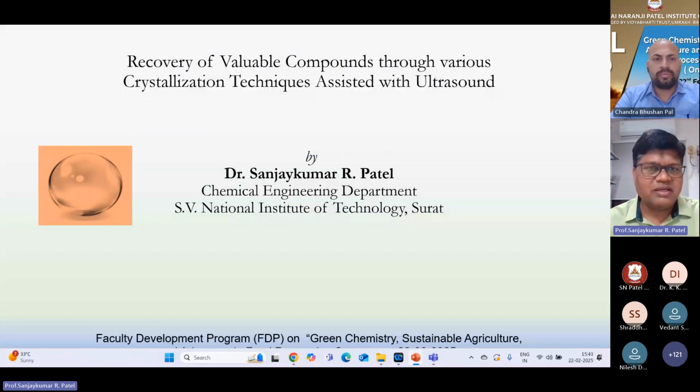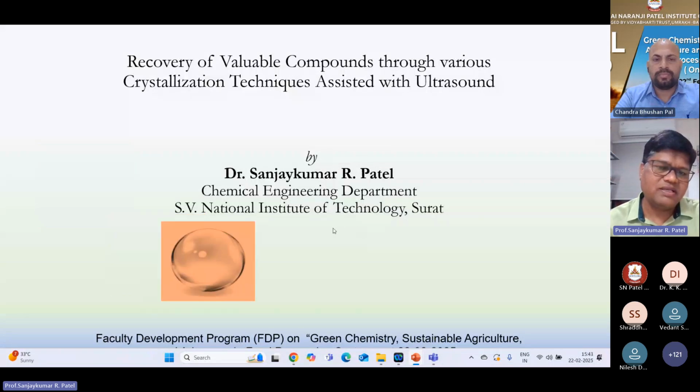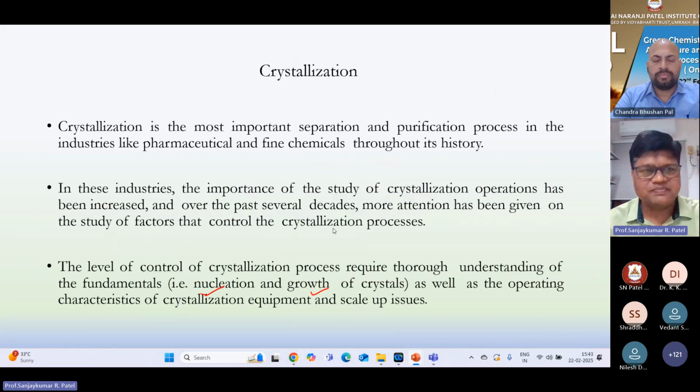So let us start then particularly with what exactly crystallization is. I'll say crystallization is the most important separation and purification process for most of the industry. Most of the industry, wherever the final product comes, is in the solid phase.